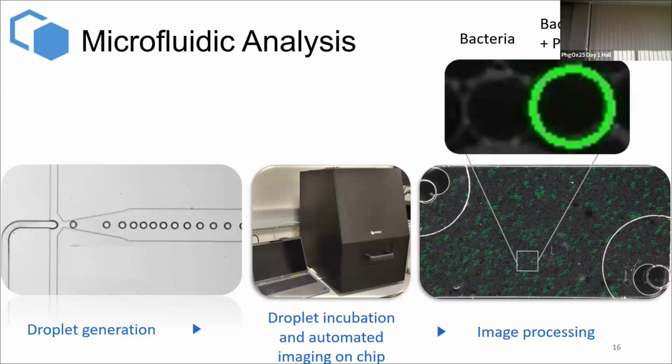So to recapitulate, in the device, we get droplets. The droplets are incubated in the device itself. We have imaging analysis in that, and then you can see the image like this. Each droplet is followed individually.